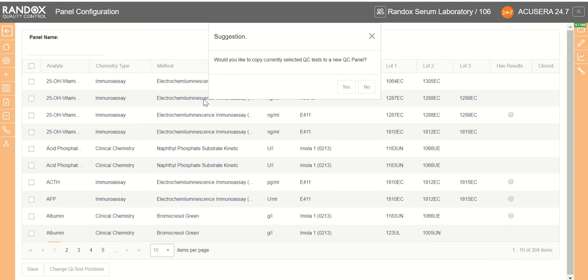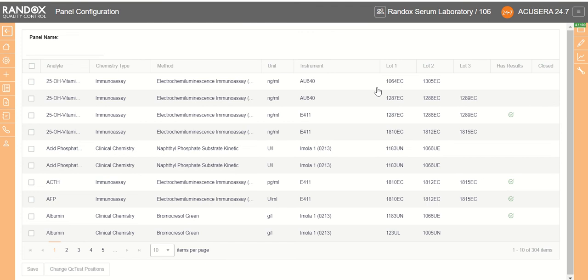Sometimes you'll be given this suggestion. This is because we already had QC tests selected on the home page, which would copy our currently selected ones to the new panel. Today we're going to select no and begin from scratch.